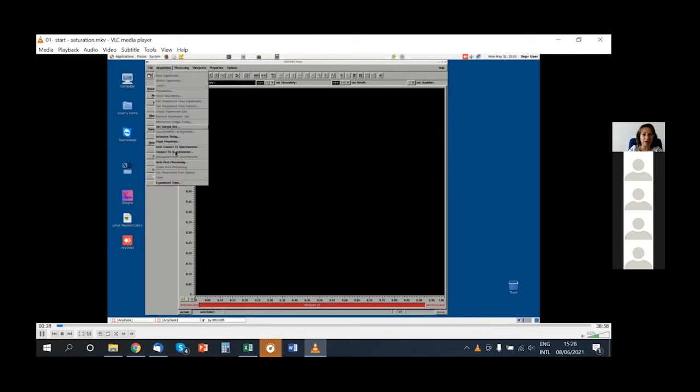All the comments I make here are remote comments, and there are some delays. But from time to time, I will speed up this video. So we connect now.